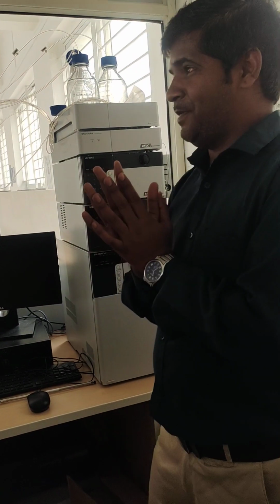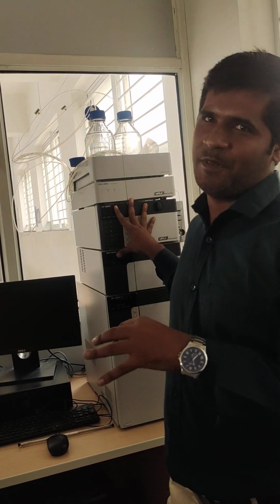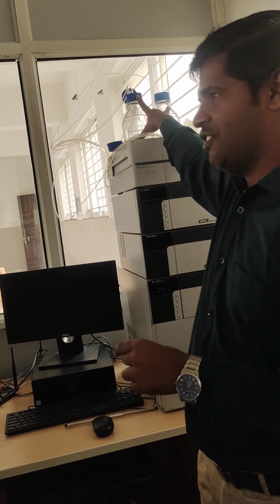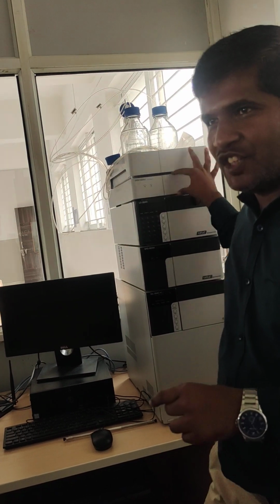What is the purpose of quaternary pump? 4 samples, 4 solutions. Again, I say gradient system. Gradient system requires quaternary pump. If you want to analyze the sample at a different concentration of mobile phase, the gradient system is required and quaternary pump is required. That's why we have loaded the quaternary pump for the gradient system. Isn't it? So, solvent cell or solvent reservoir, degasser. What is the function of degasser? Removal of air, to remove the bubbles, to remove the gases in the particular mobile phase, isn't it?